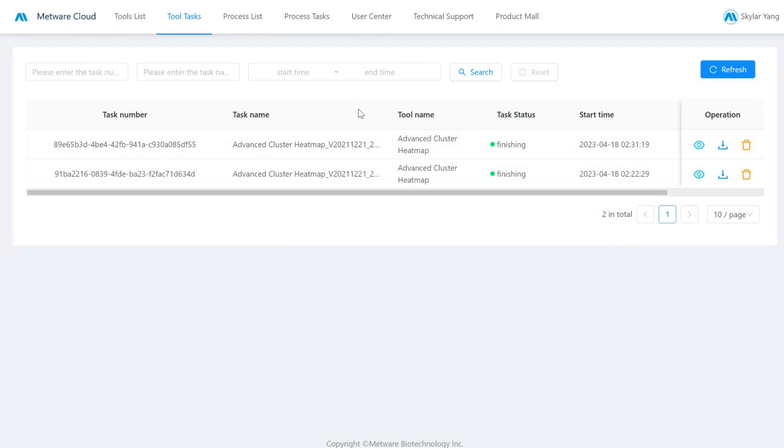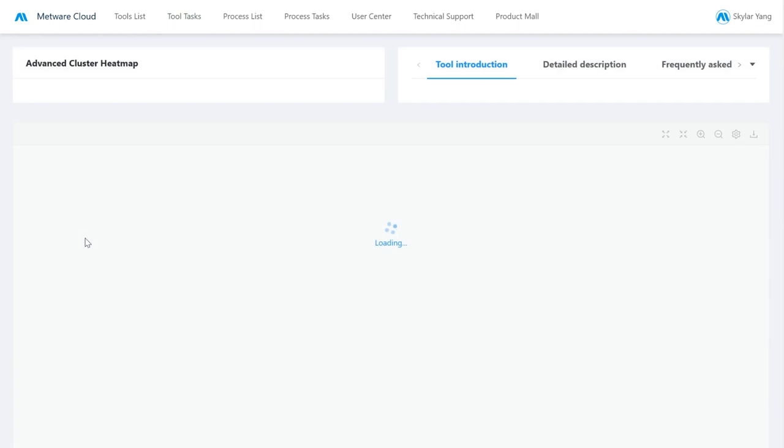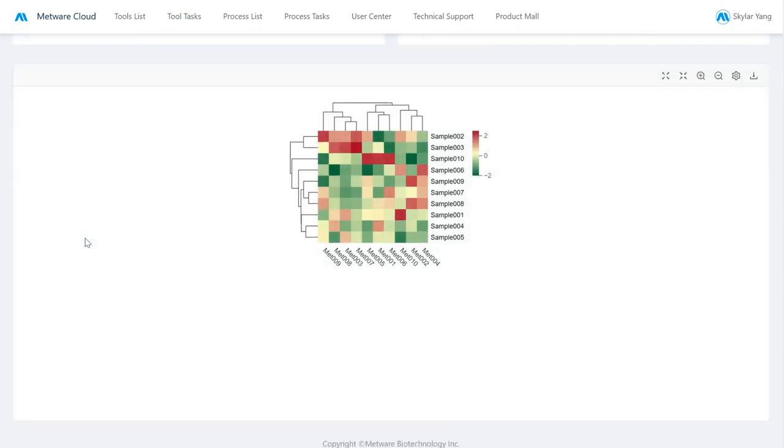So here we can see the work that's done. You can download it, or you can view it.